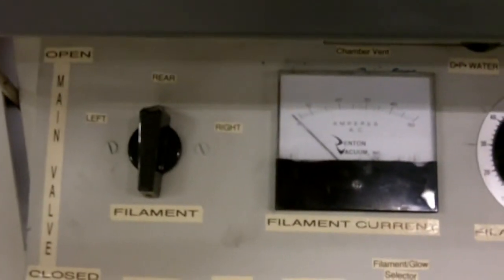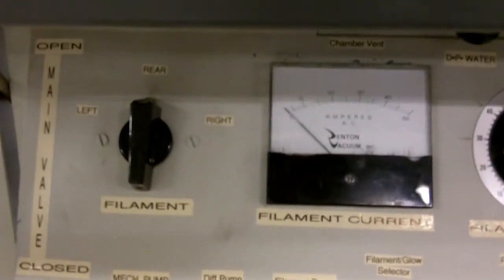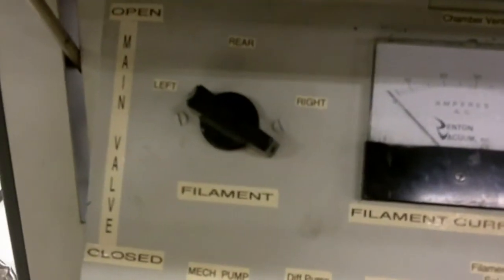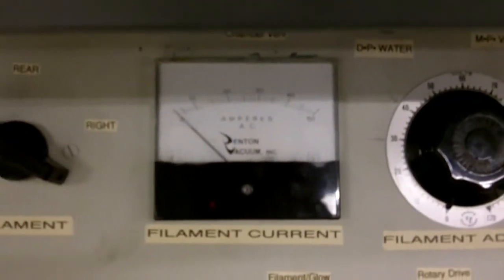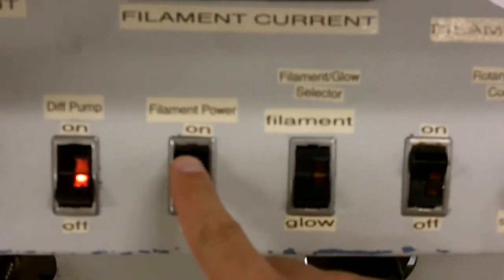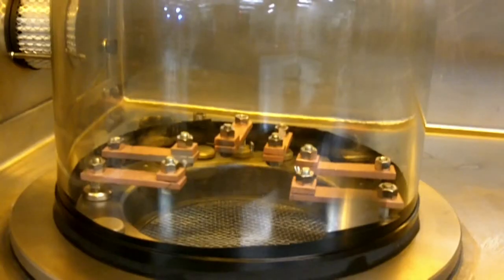The system is already pumped down and in high vacuum, so we won't concern ourselves with those controls at the moment. Here we have the filament selector: left, rear, and right. We're going to put it on left. We have the filament current indicator, the filament current control, and down here we have filament power. We're going to turn filament power to on and then we can begin.